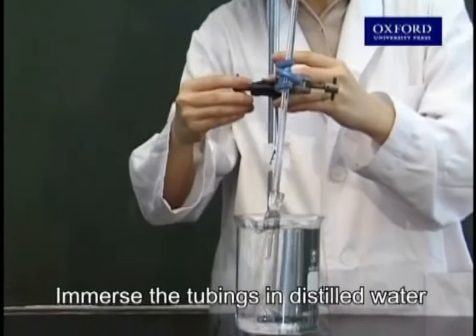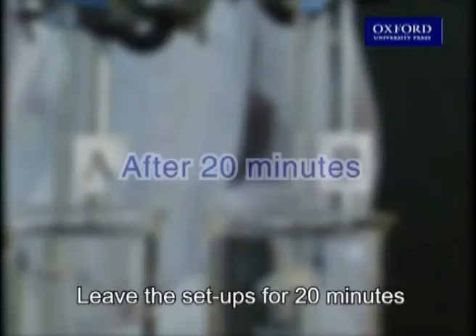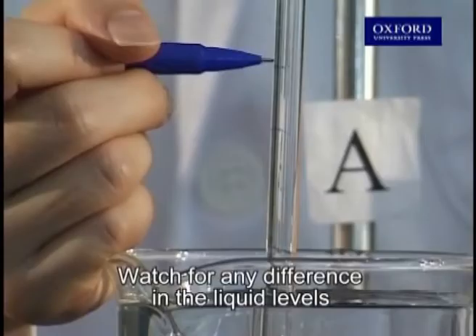Immerse the tubings in distilled water and mark the initial liquid levels. Leave the setups for 20 minutes, then watch for any difference in the liquid levels.